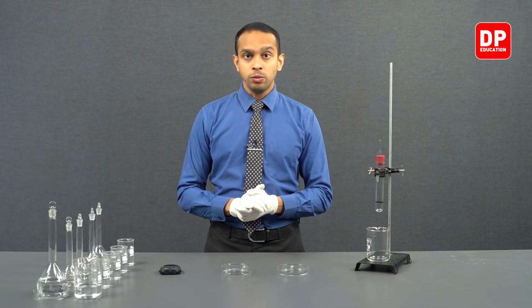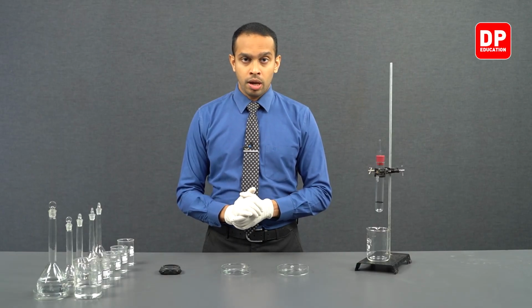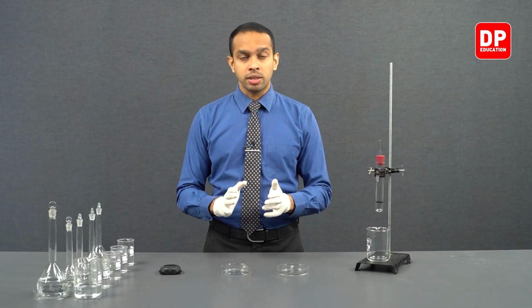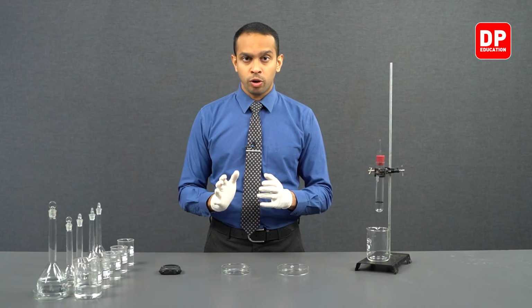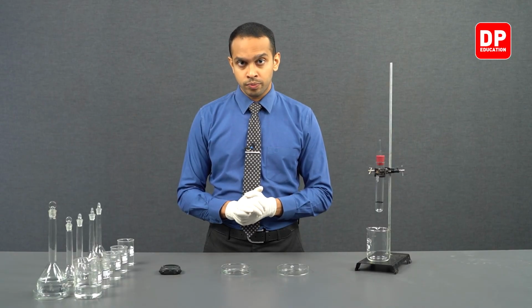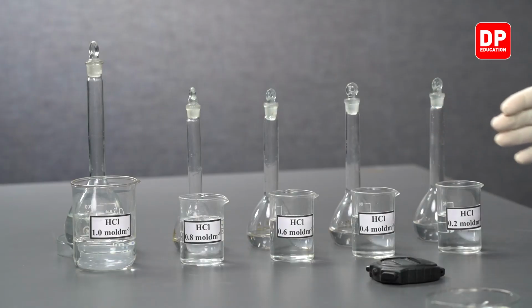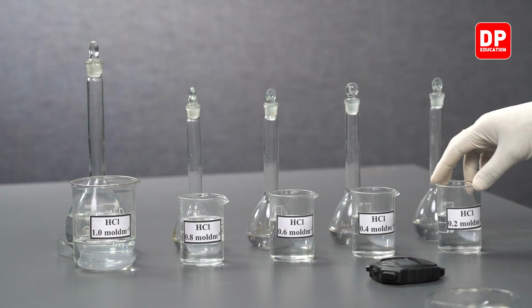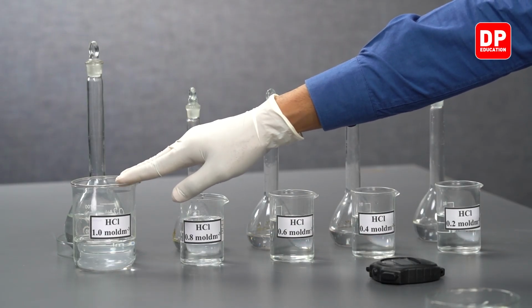Students, now we are going to react magnesium with HCl, and we are going to observe how the rate of this reaction is going to change when the concentration of HCl is changed. To observe that, we have prepared a few solutions of HCl having different concentrations. The HCl concentration range from 0.2 moles per decimeters cube all the way up to 1.0 moles per decimeters cube.